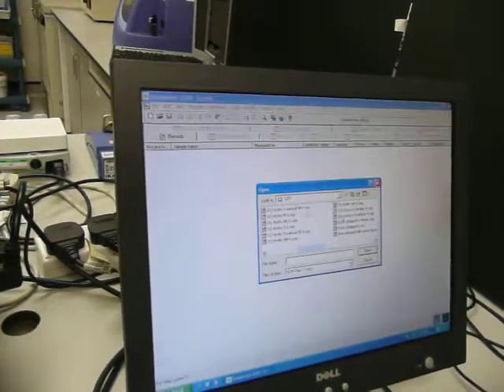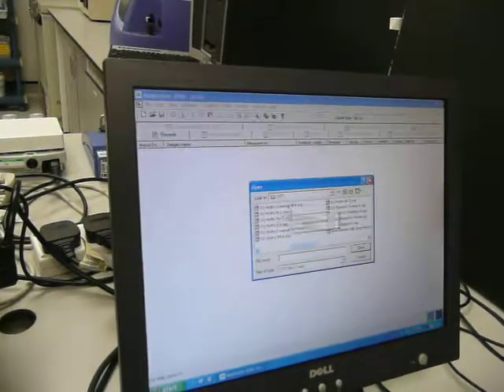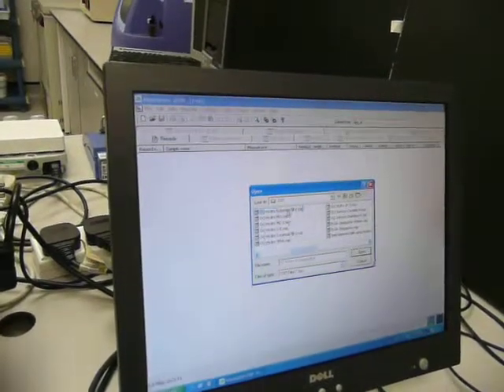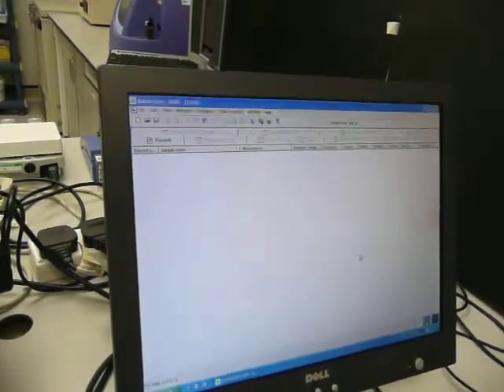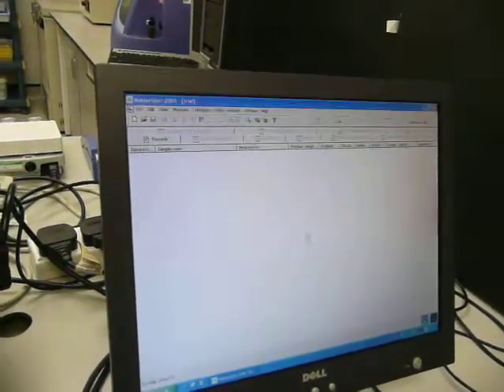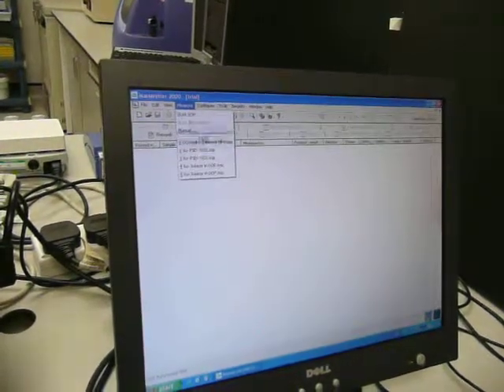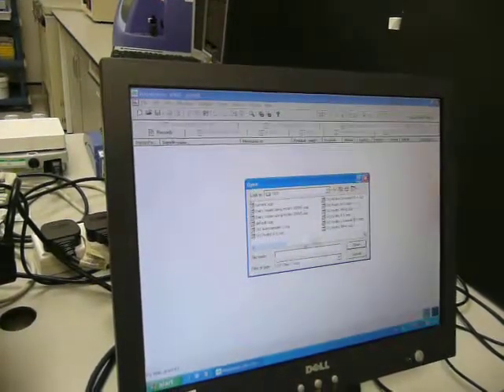For example, you can start as a new file. No, it's not there. I need to use the other one. Push us down.